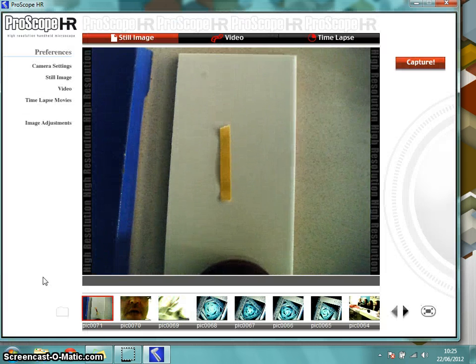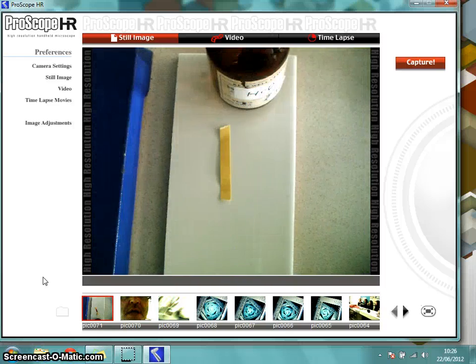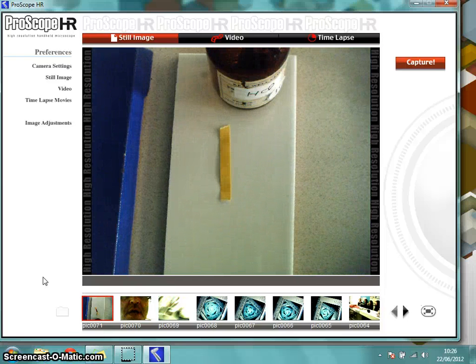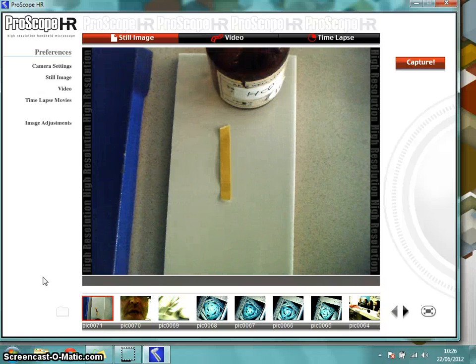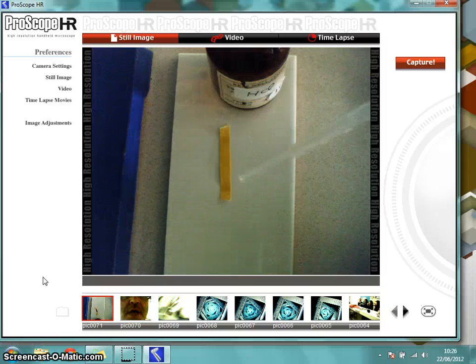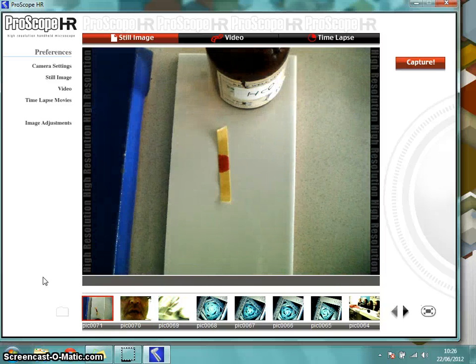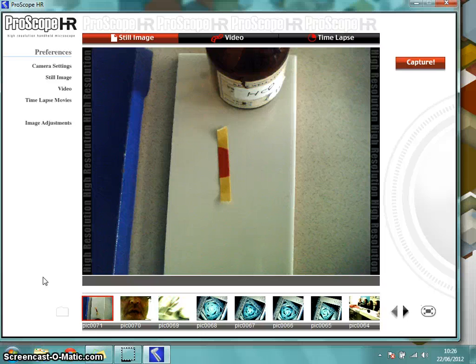The camera right now is above a piece of universal indicator pH paper on a ceramic slide. I've got 1M hydrochloric acid, and this isn't a substitute for students doing a practical, but say in a content lesson where you introduce indicator paper and you just want to familiarise students as to the colour change. Now this is on my computer screen, it's also on the interactive whiteboard, and everybody in the room can see this.